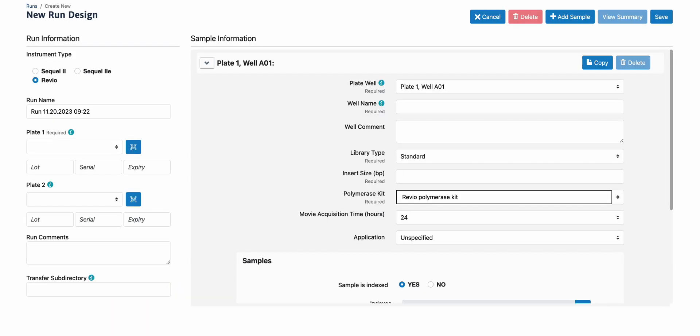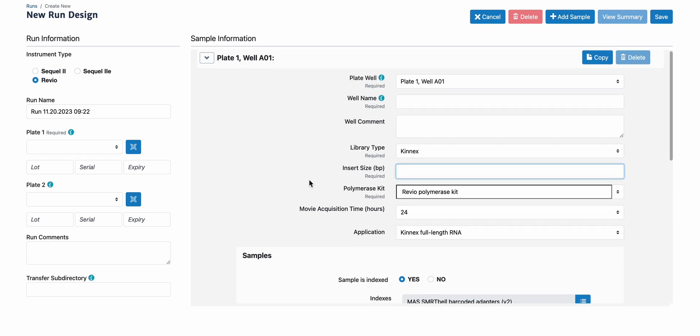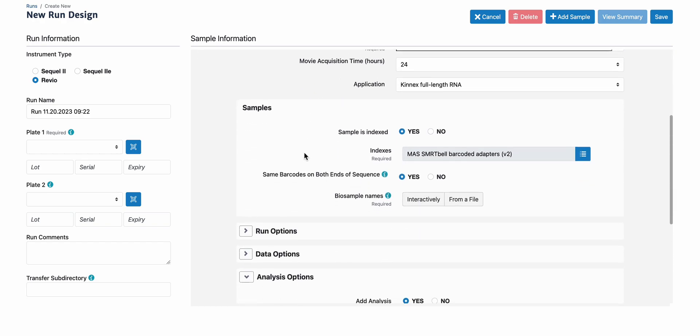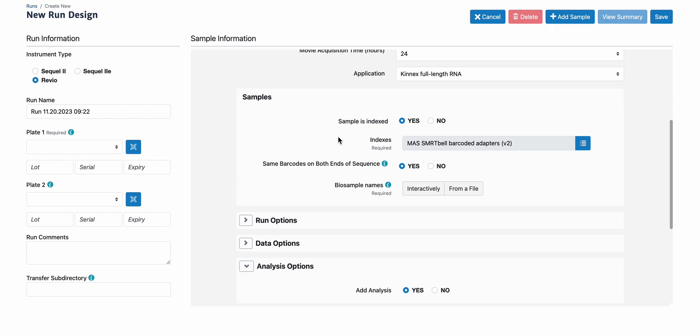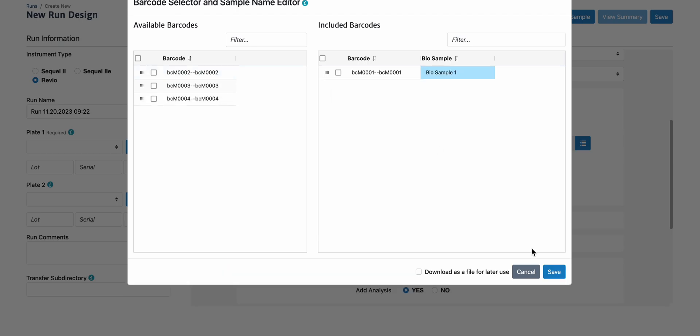Now let's look at run design. Again, in the application, let's select Kinex full-length RNA. All Kinex kits use the barcoded Kinex adapters, so the sample is indexed. The indices are currently called Moss Smart Belt Barcoded Adapters V2. There are same barcodes on both ends of the sequences, and using the interactive menu, you can select which barcodes you have used.